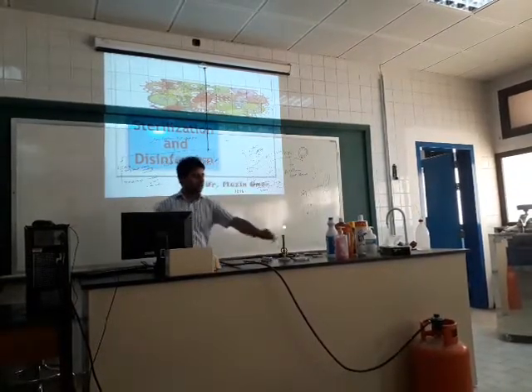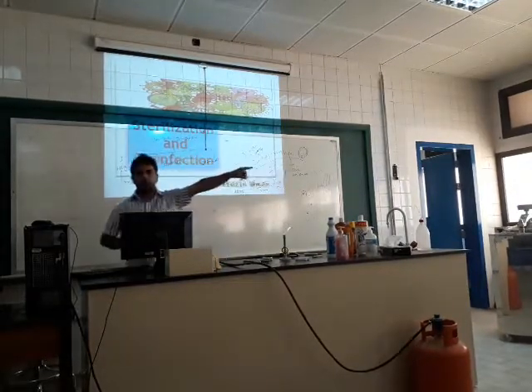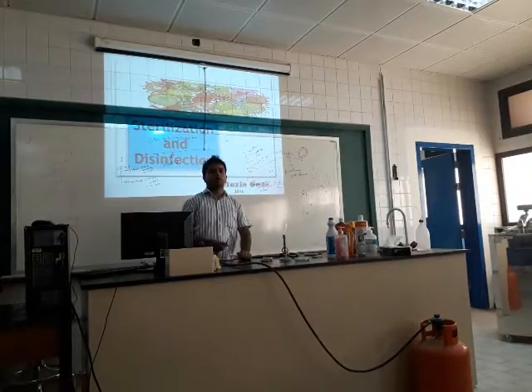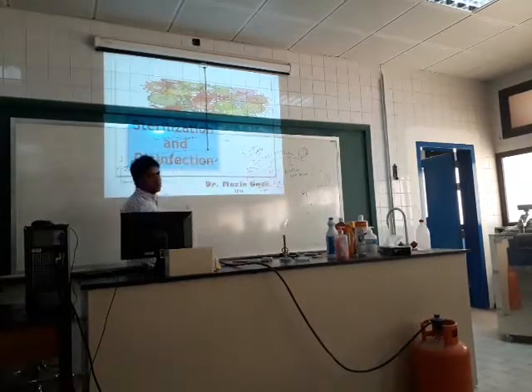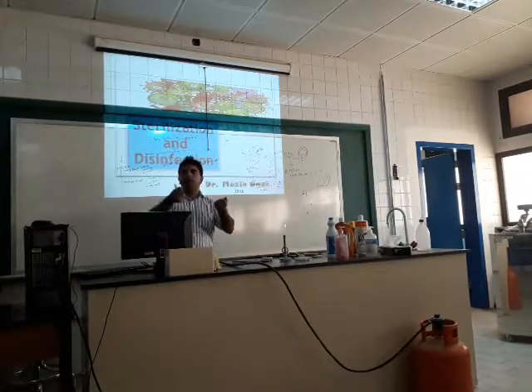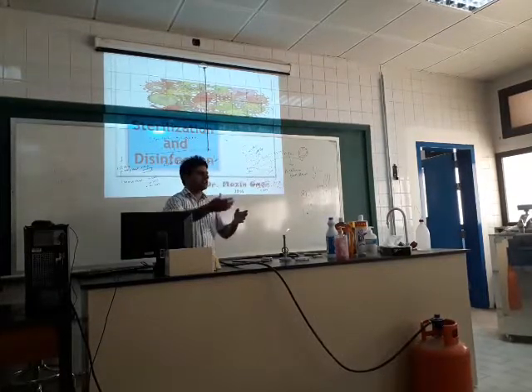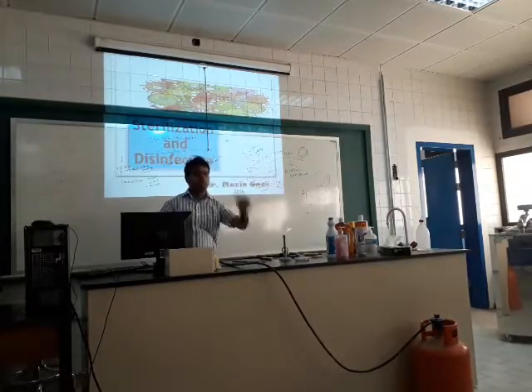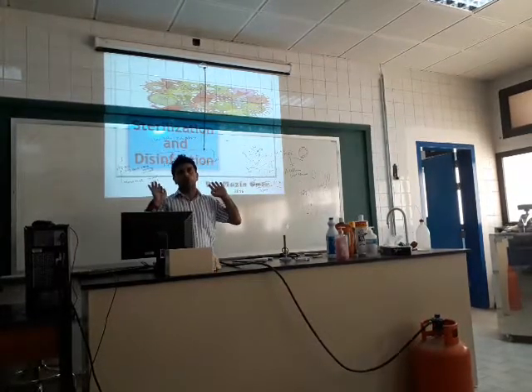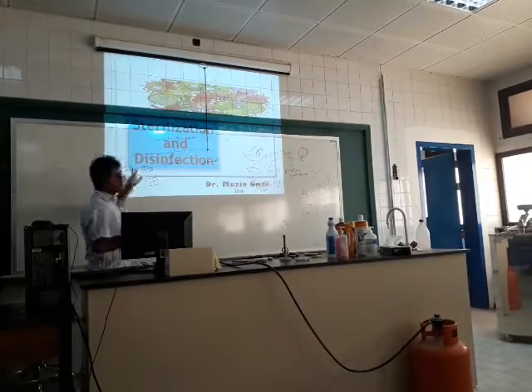Another method. One method is direct flame. Another method is the hot oven. And the third is called incineration. What is incineration? For example, parts of a body like skin parts, other things, microbial cultures, you put them directly into the fire in the machine and you destroy them. This is called incineration.